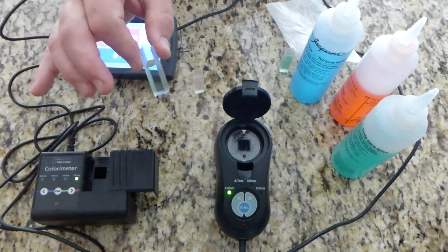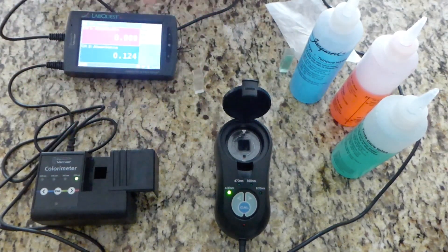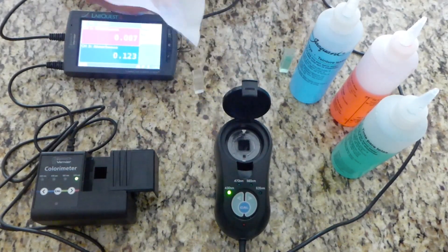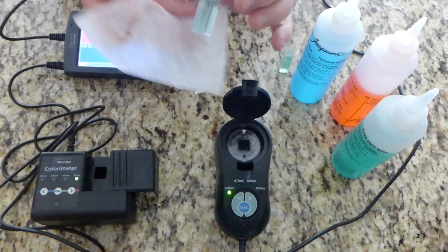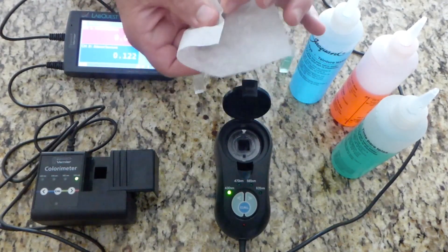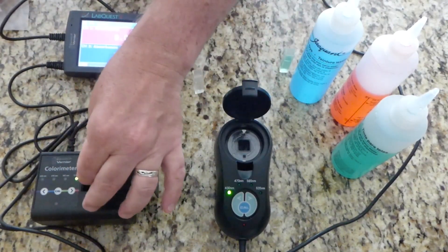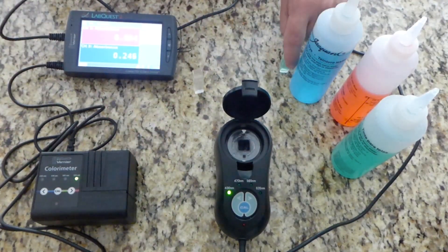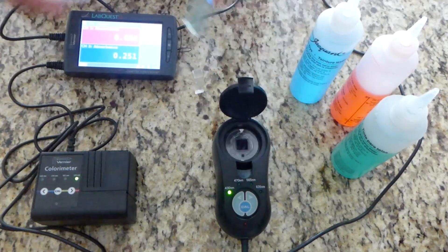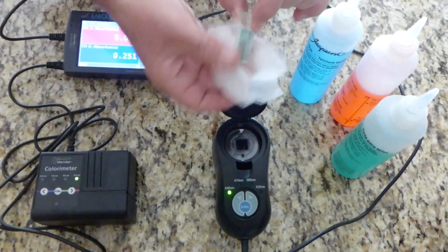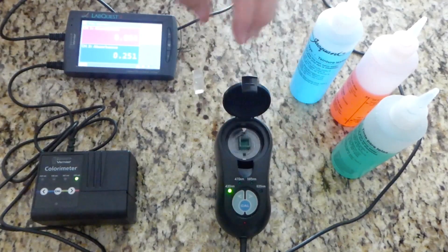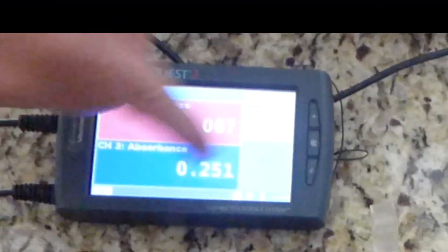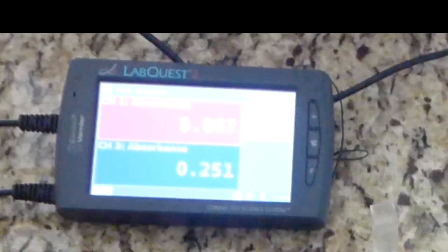Now you're ready to test a solution. I've put a green solution in the cuvette. Again, you make sure that you align the clear side with the beam of light. You need to wipe it off. So grab a very soft piece of tissue paper or something like that, clean off the cuvette. Because you don't want smudges and droplets on the outside, close it, and you don't have to do anything. You only have to read the reading.